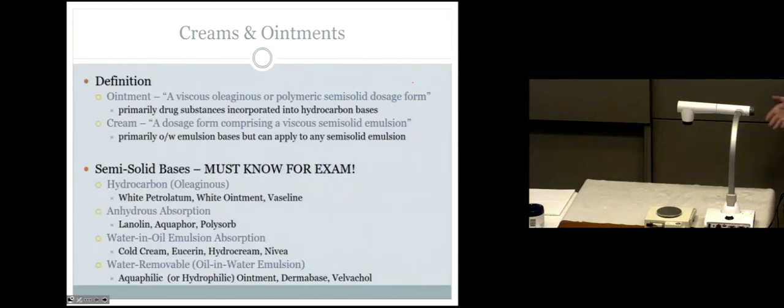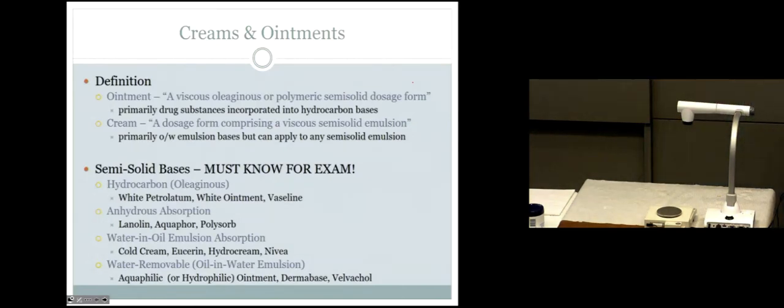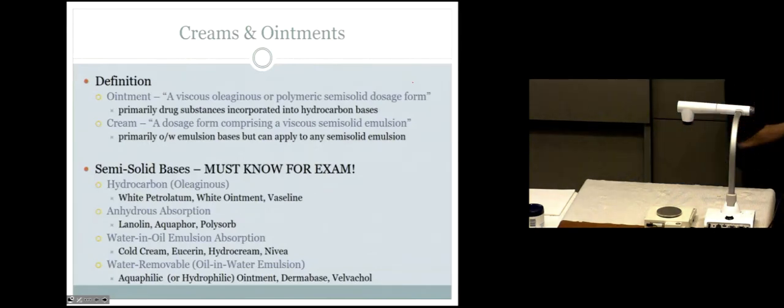Can somebody tell me a good property of an ointment, that separates it from a cream? An ointment would be greasy, absolutely. Thick, kind of stiff, tends to be yellow. So a hallmark to visualize in your own mind is Vaseline. Have you ever seen Vaseline or maybe Aquaphor? We're going to be doing Aquaphor up here for the dry lab. It is thick and it is stiff. It is a yellowish color.